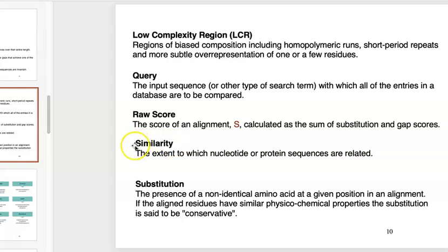At the nucleotide level, similarity is considered based on, for example, the wobble effect, where at the third codon position, we know there are multiple codons that can encode the same amino acid. Just because two organisms have a different codon doesn't mean those two codons aren't still encoding the same amino acid. The software can recognize that wobble effect, and therefore, even though it's not identical, there's still a similarity score that gets factored in.